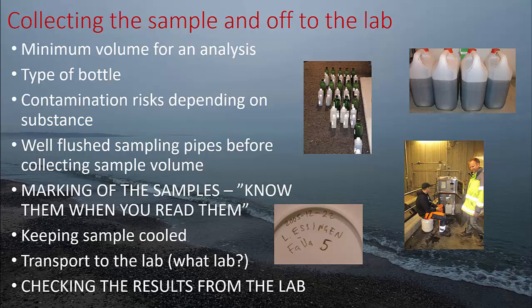When you get results back, always scroll through them, even if you have many other things to do. Take some time when you get results to check them. And here again, when you mark the sample well, it's easy to see if there are some results that are way off the scale. In this case, you immediately call the lab back. Because today, if you leave the results lying and too much time goes by and there is some error, sometimes they can't do the analysis again.